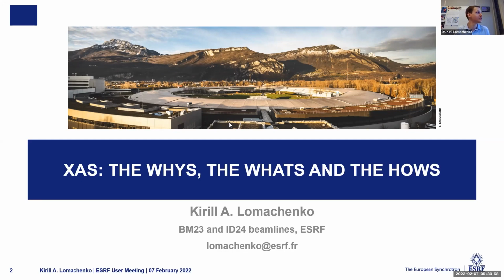That's what's done very often in environmental science, because when people measure soil, for example, they are interested in some traces of, say, lead in the soil. You don't have percents of lead, you have tens of ppm, or sometimes even lower. There, of course, you'll have to measure for a long time, but you can get reasonable data even in the ppm range.